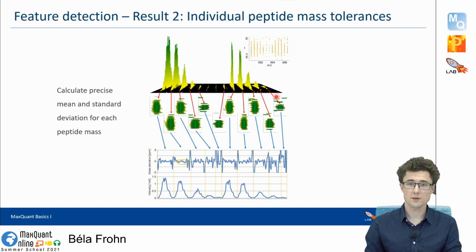So one more thing, this is really important and crucial about the feature detection: as we have many peaks here, over the retention time, over mass to charge ratio and different pairs and so on, we have really, really many data points for the mass estimate. Because what we eventually want to know is how heavy is the peptide which we measured here in proportion to the charge. And then we can somehow figure out which peptide might have given origin to this thingy here. So what we want to find out is the mass.